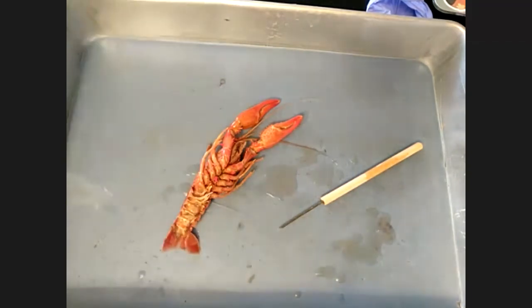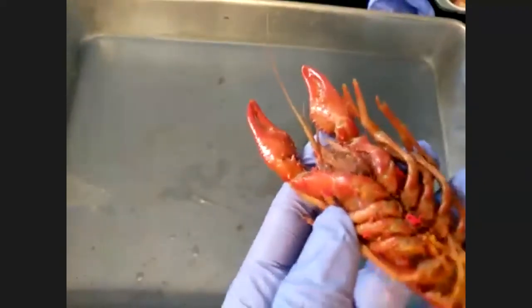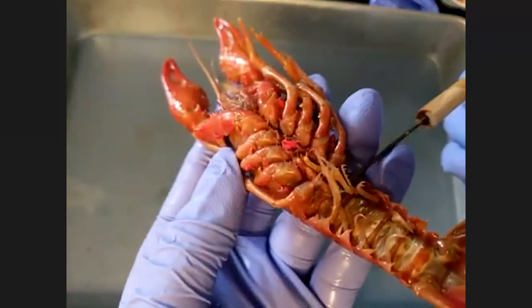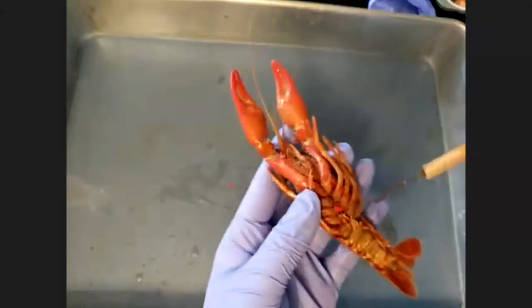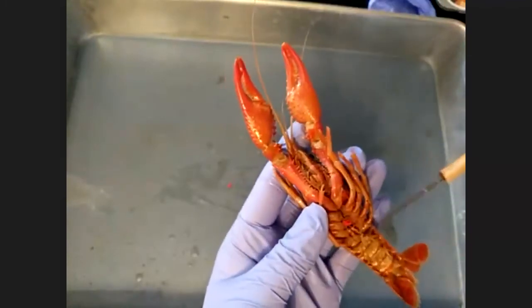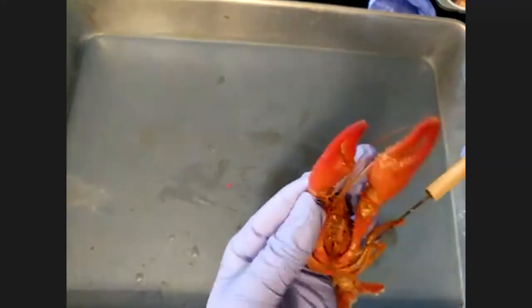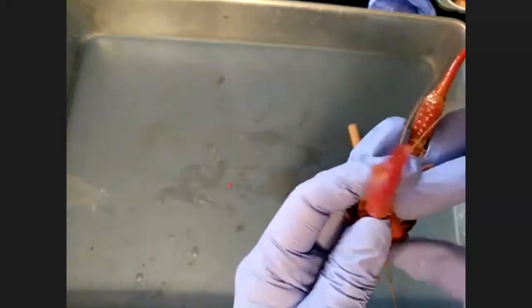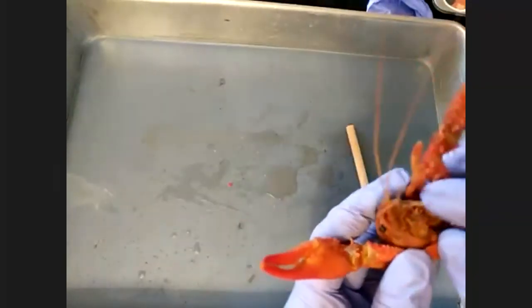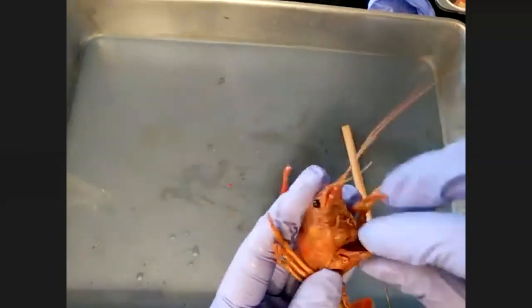All right. So our crawfish, back to telling whether it's male or female, the long swimmerettes right here, those long structures, that is how we can tell if it is a male or female. And I wish I could pull the mouth structure up. Okay, and then in the mouth, I didn't show this to first hour, so you guys get the luxury. I'm just going to rip its legs off because those are in my way.